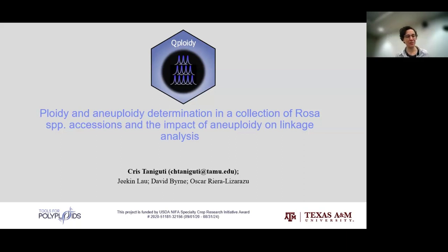And so this is a newborn software that we are still developing. It's still not available, but I'm excited to show what we got so far. It's for determining ploidy and aneuploidy, and so far we apply it to our roses.